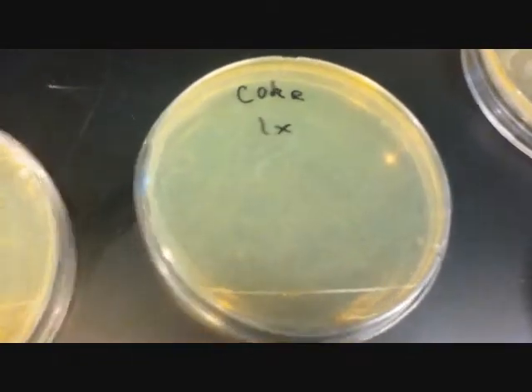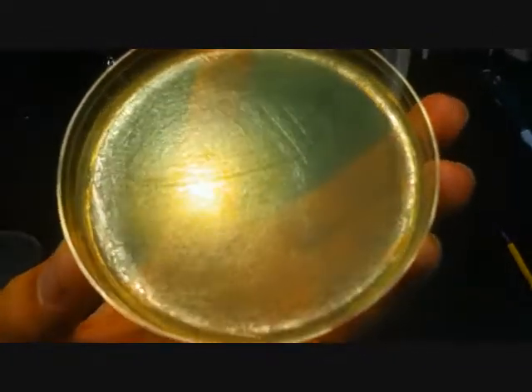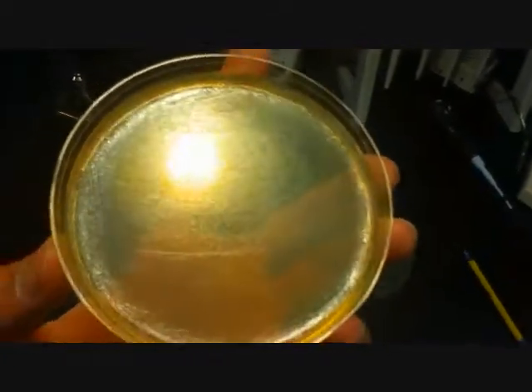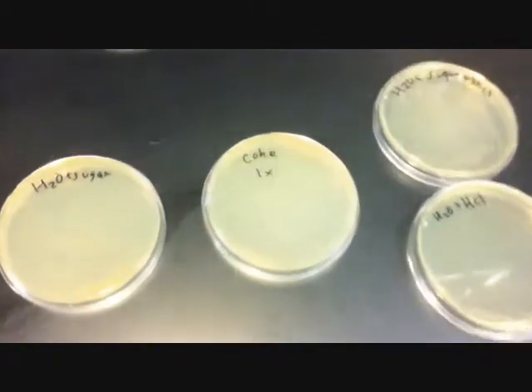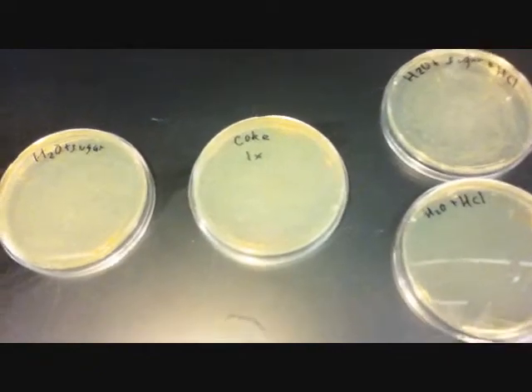The Coke had sugar, and it grew a little bit less than the H2O plus sucrose. Because the acidity was at pH 2.5, and Listeria likes pH 5.6 to about 7.8 or so. So this was well below that, and it held on because it wasn't as low as pH 1 — which is these guys, and these guys are just bare and dead.